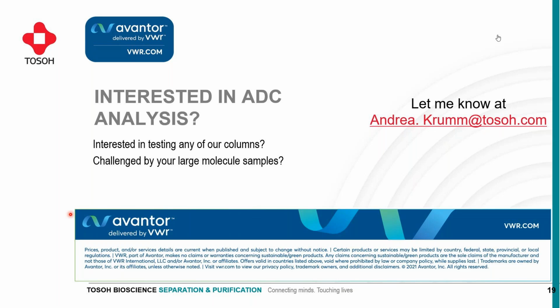Yeah, there are several possibilities actually. One typical thing is you could go for 280 nanometers, just like for normal protein measurements, which basically looks at or detects the aromatic side chains in your protein. However, for normal protein you have one big peak and several smaller ones, but here you typically have them separated. So I would rather recommend to use 215 or 220 nanometers, because that looks at the peptide bond rather, and is more sensitive as compared to the 280 nanometers.